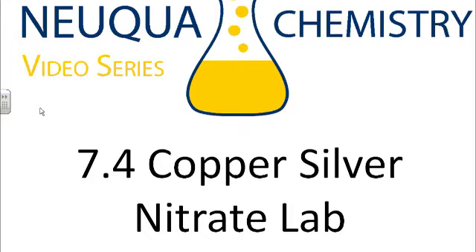So first of all, the problem that we have here, we have a single replacement reaction where we're going to take copper and silver nitrate and we're going to replace the silver, so we get silver.